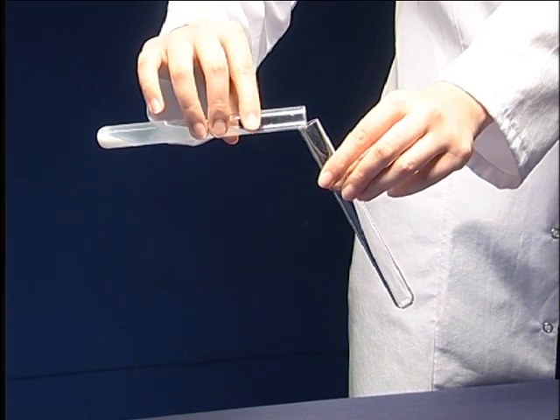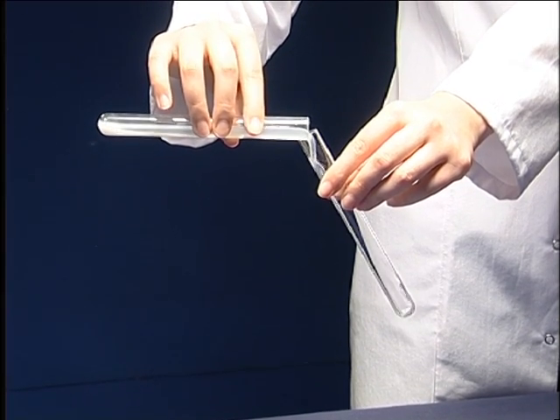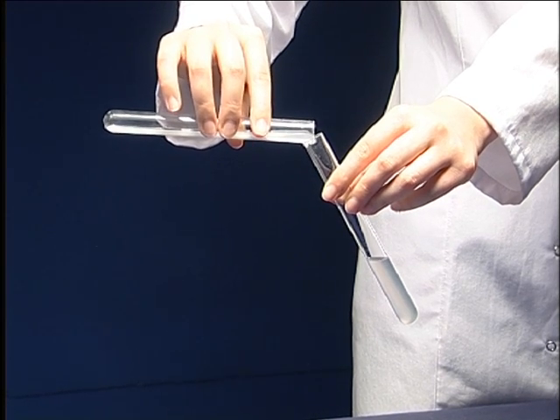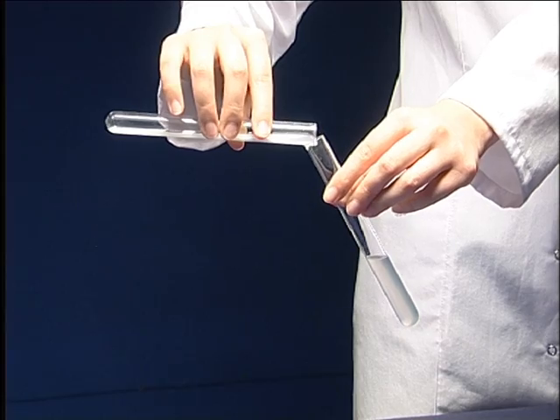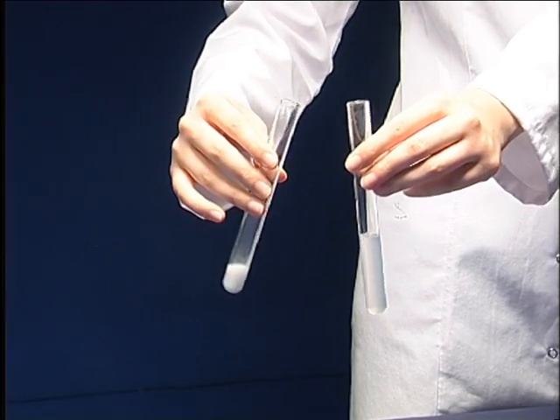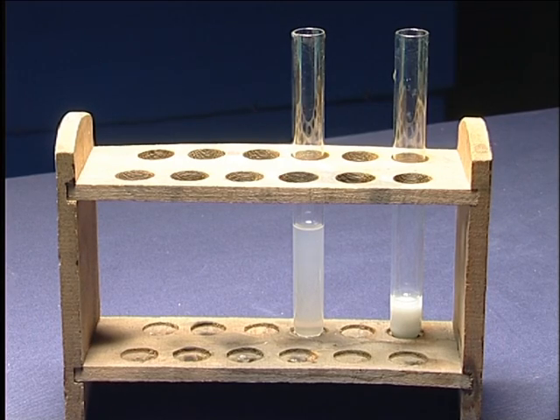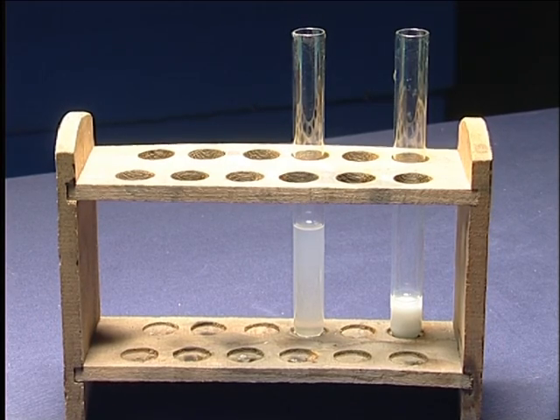After all solid barium sulfate has settled down, pour off only the liquid part into another tube. Separation of a solid and liquid by pouring off the liquid is called decantation.